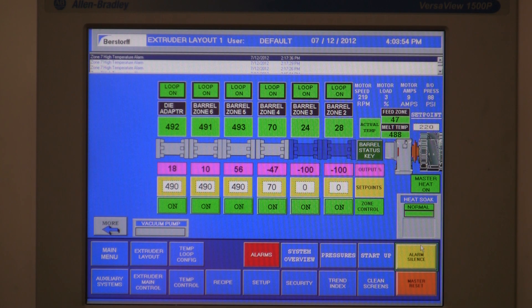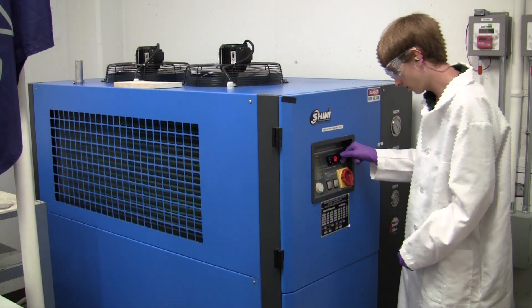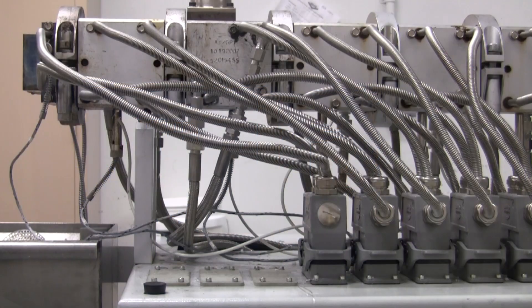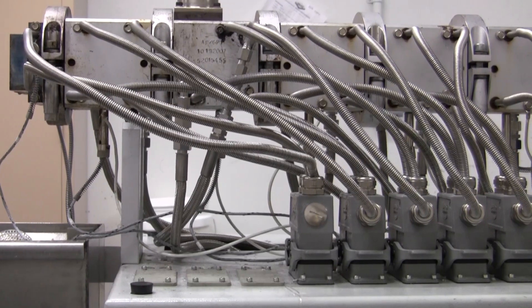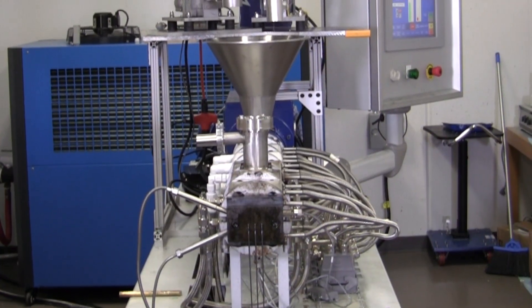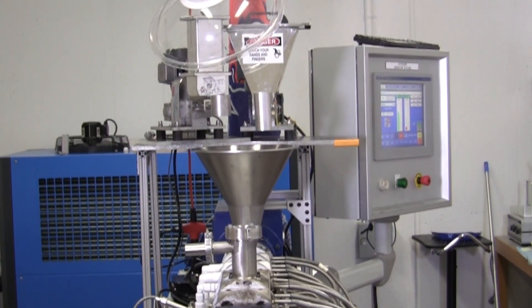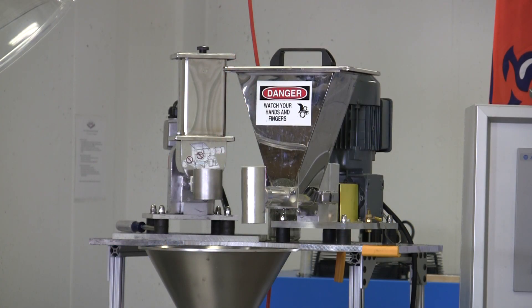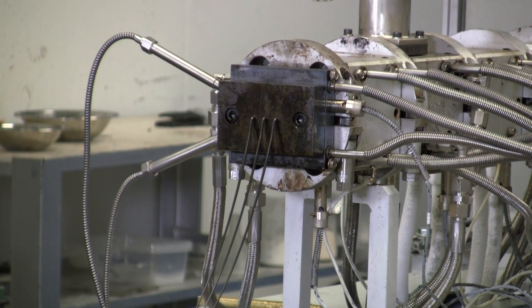Note that each zone has an independent temperature control. The low temperatures in the pulverization and transition zones are maintained by the recirculating ethylene glycol water mixture, which is kept at negative 12 degrees centigrade by a 10-horsepower capacity industrial chiller. On the other hand, the melt temperatures in the extrusion zones are provided by the conventional electric cartridge heaters. The materials are fed at a constant rate using individual volumetric feeders. Note that this is the only location where the materials are fed or co-fed — no additional side ports are present. The output of the SSME process is in the form of continuous molten polymer strands, similarly to that of conventional extrusion. The extrudate is typically cooled in a water trough, air dried, and pelletized for storage.